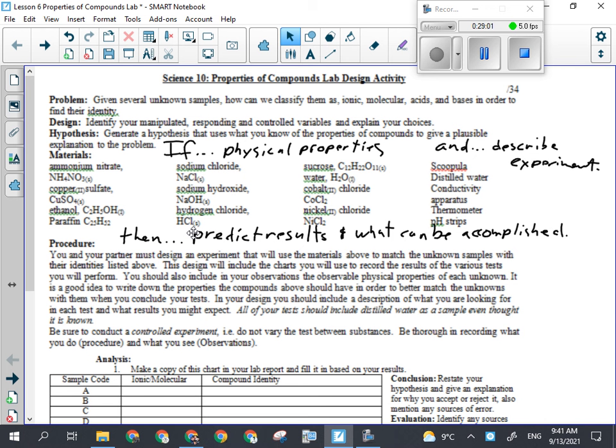Okay, what test do I perform next? Now I perform the conductivity test, because now I have a solution. If I just put this in a dry sample, nothing's going to happen. So I need to have a solution before I do this test. Now, something else with the solubility test also applies to this test. What should I do to the thermometer, the stirring rod, and this thing between tests?